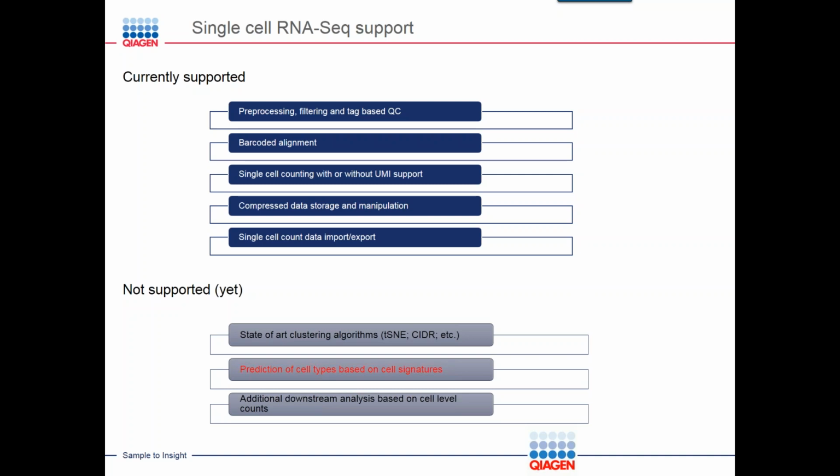What's not being supported yet are those state-of-the-art clustering algorithms. We have seen a lot of new algorithms that are designed for this single-cell data. They are usually available in open source tools. We still have plans to integrate these algorithms through our engine, so that the user can easily get this clustering through the server-based integration.